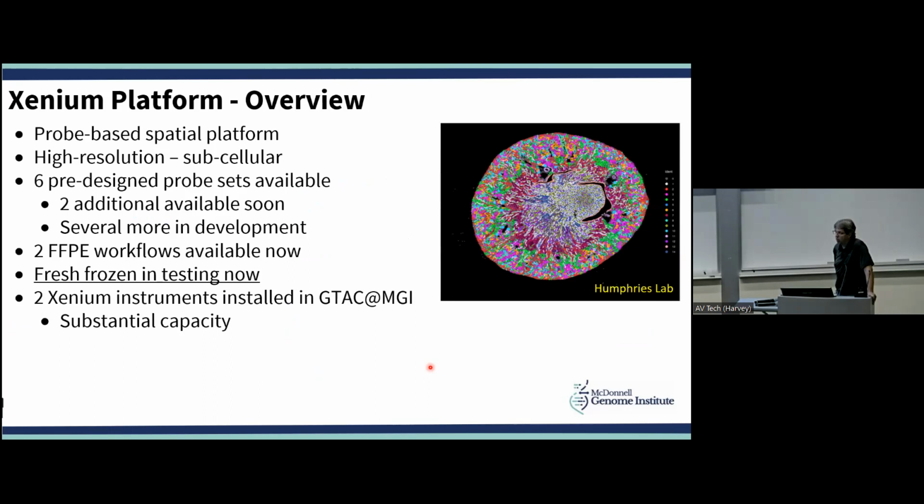And it's a pretty important decision point, because as we'll get to at the end, this is not cheap technology. I'm going to just point that out right now and make sure you all understand that. You don't want to have a lot of failures here, because this is not like having a failed run where you spent $100 on sequencing or something. This is a much more expensive platform.